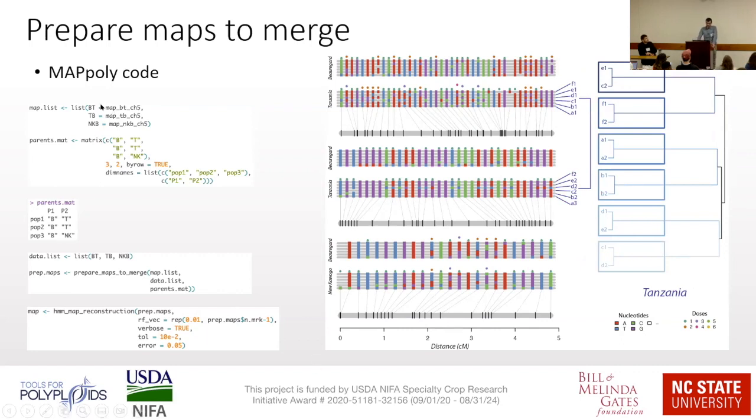And basically to do this, you need to have your MAPpoly maps constructed, the list of maps for each chromosome, okay? So this chromosome 5 actually is not chromosome 1. You make a list with the chromosome 5s from your several maps, and you can have as many maps as you want here. I tested with like 20 maps with simulations, but I just don't want to show simulations, but you can do this. And the computational time is linear in this case, which is very important.